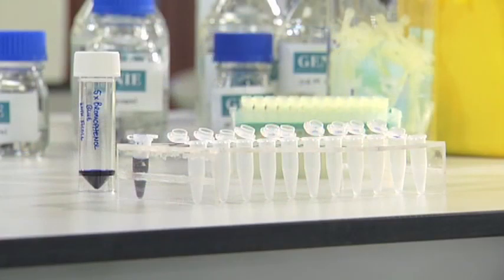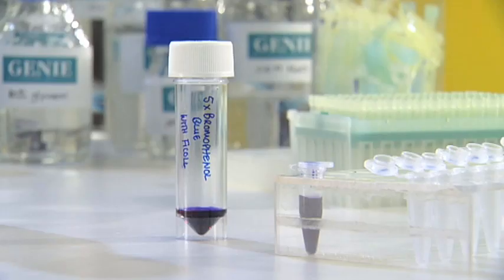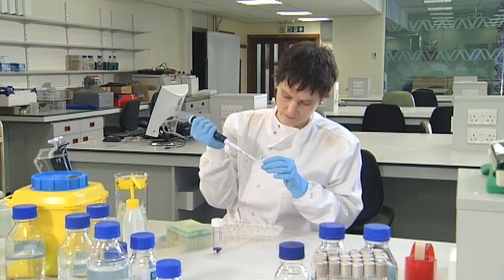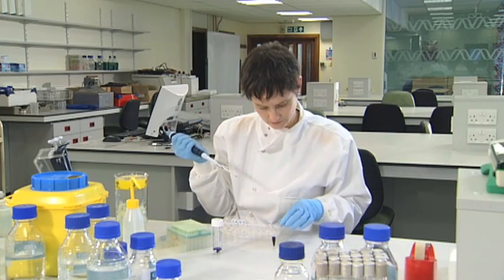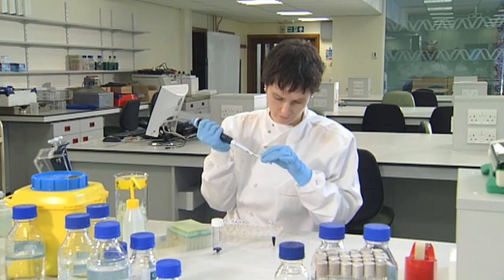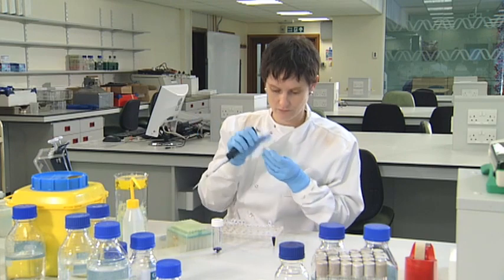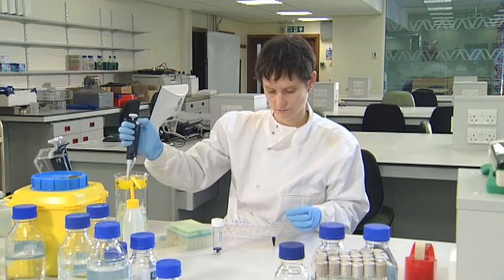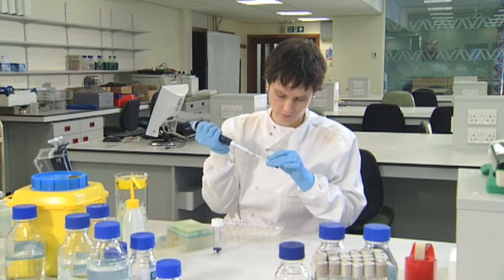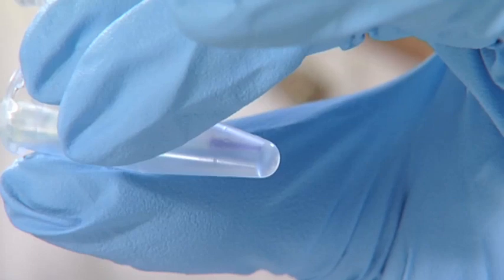Before loading nucleic acids into the wells of a gel, you need to add coloured loading buffer to the samples. Different coloured dyes can be used, but one that's commonly used for this purpose is bromophenol blue. The loading buffer is made up of dye and a glycerol or phycol solution. The dye colour helps to visualise the loading of the samples into the wells and helps to keep track of the migrating samples. The glycerol or phycol makes the samples heavy so they sink to the bottoms of the wells.